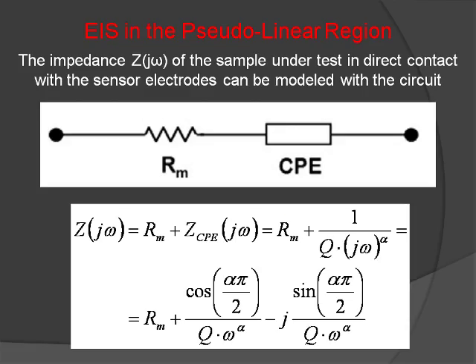The electrical model used to fit the data in the investigated frequency range is composed of a resistance, accounting for the resistance of both the sample and the interface, and a constant phase element, resulting from the essentially capacitive component due to the interface electrode medium. Since the ice cream is an unstructured material, no distinct dispersion exists within the radio frequency range up to several megahertz. The sample impedance is thus purely resistive while the reactive component is essentially due to the electrode interface.